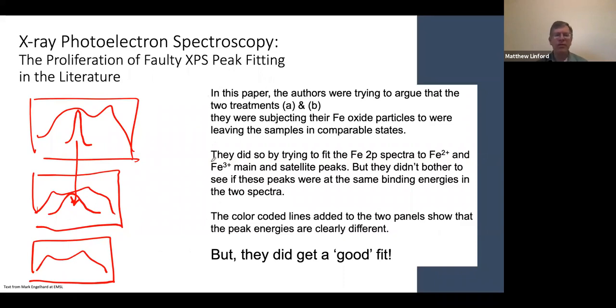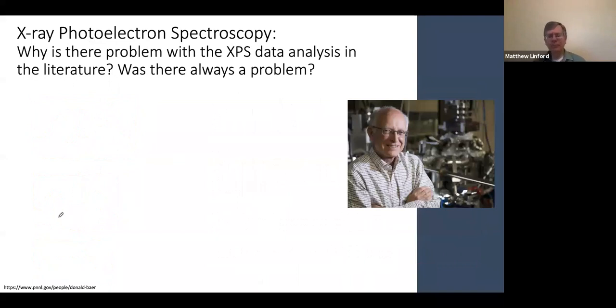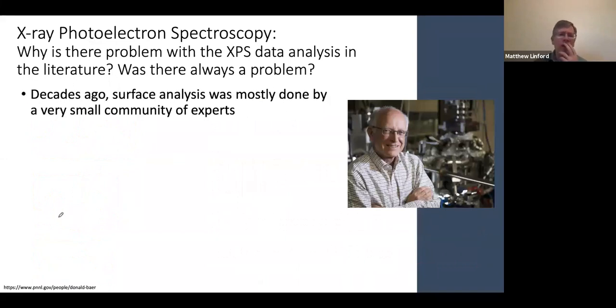And this paper, I'm not even going to tell, I haven't given you a citation for it, but yes, these people have this type of thing all over the place where they have narrow peaks and broad peaks, which they shouldn't have. And then these peaks vary all over the place between these spectra. Okay.